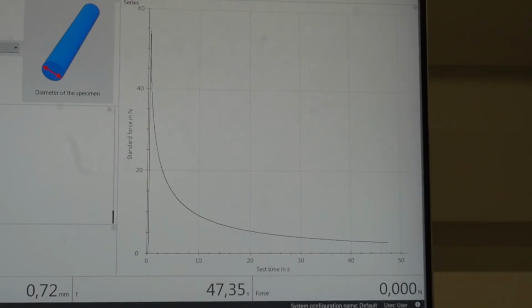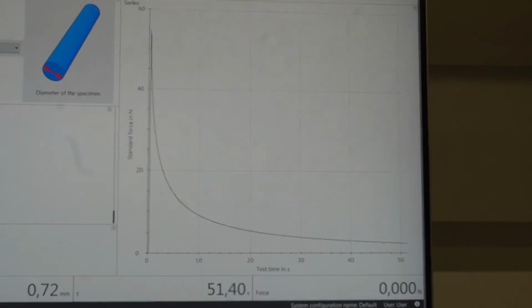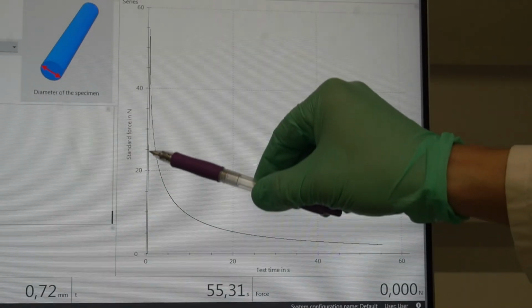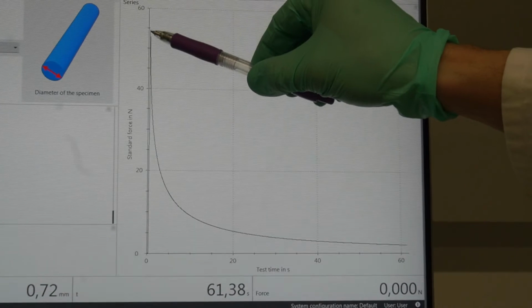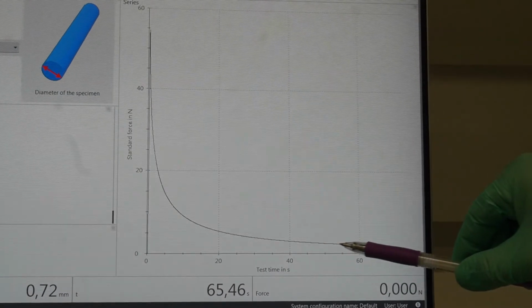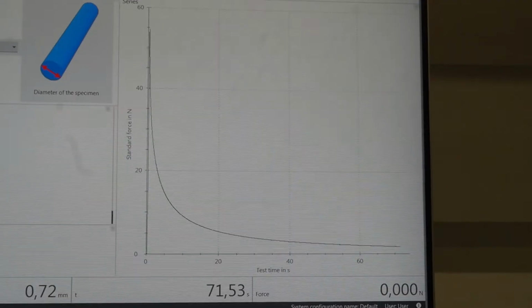Okay, the test is running. You see the force over time plot here. The step load was applied here, and the force signal reached 55 newtons, but then was dropping rapidly and is now relaxing over time. The test is already running 60 seconds. We will run it for 300 seconds.